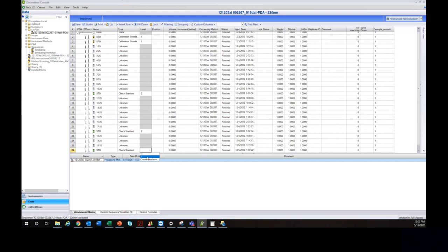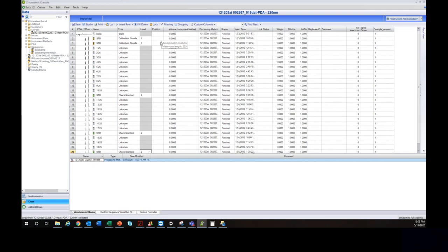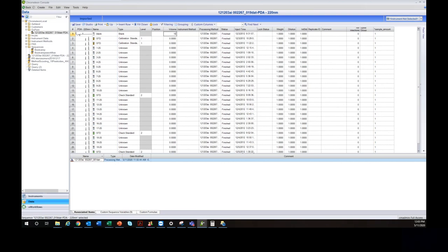The position column is your vial location in the autosampler — it didn't pre-fill from this imported sequence. Next is injection volume: that information didn't come over either, so I'll call it 10 microliters. Hitting F9 fills down, and now every injection has a 10 microliter injection volume. Injection volume is taken into consideration in calculations, so make sure you have the correct value entered.